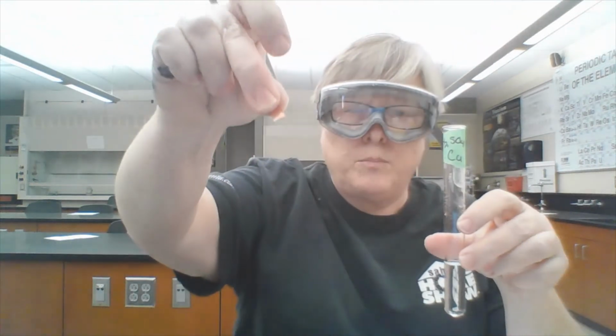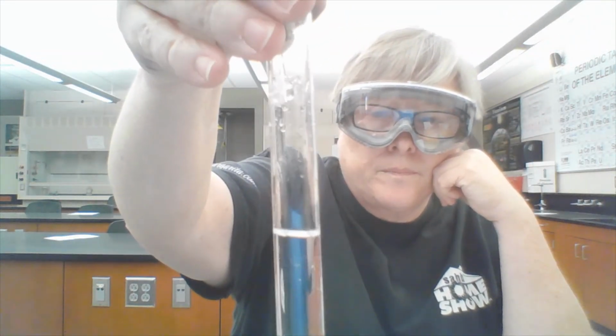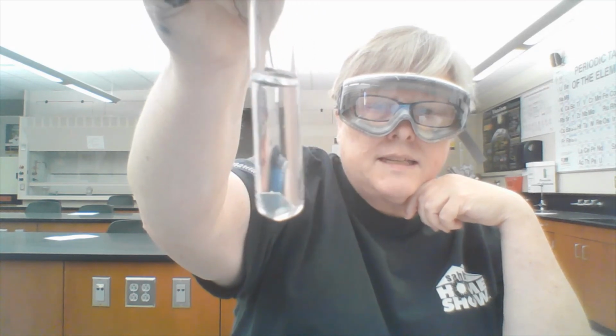Now I'm working on test tube number 5. This has dilute sulfuric acid in it, and I'm going to put a shiny copper piece in it. Let's see what happens. So far I'm not seeing anything. Let's go back and look at magnesium sulfate and zinc. It looks like nothing is happening at all in that test tube.